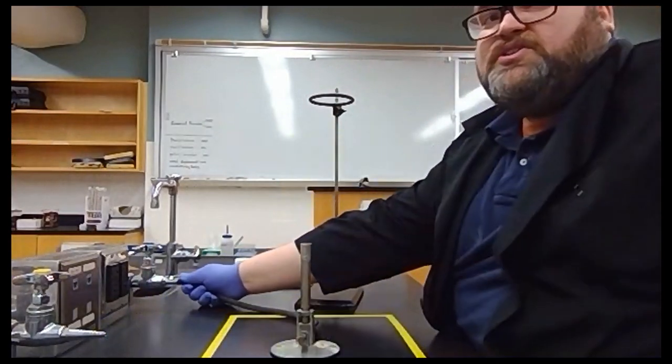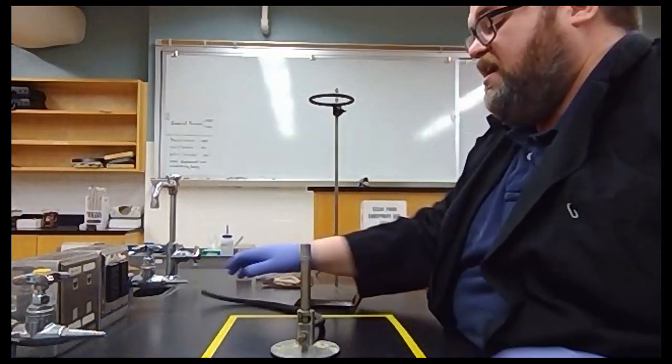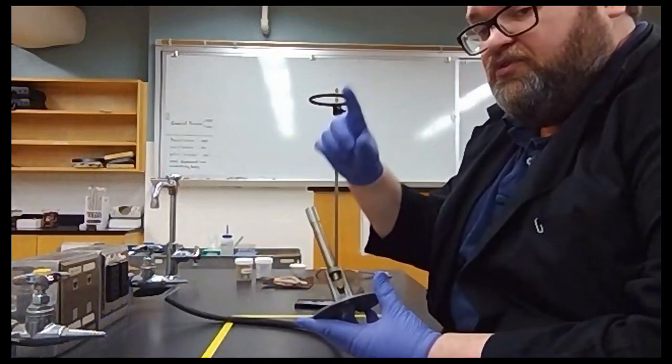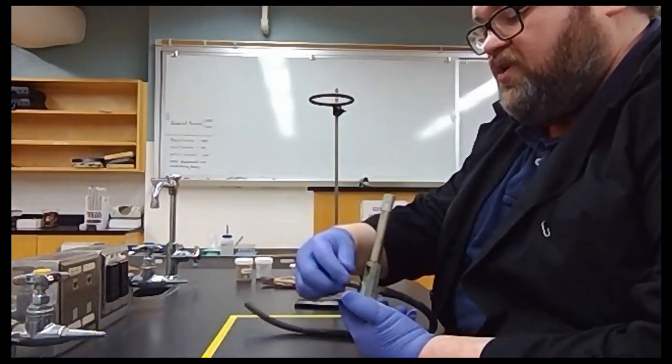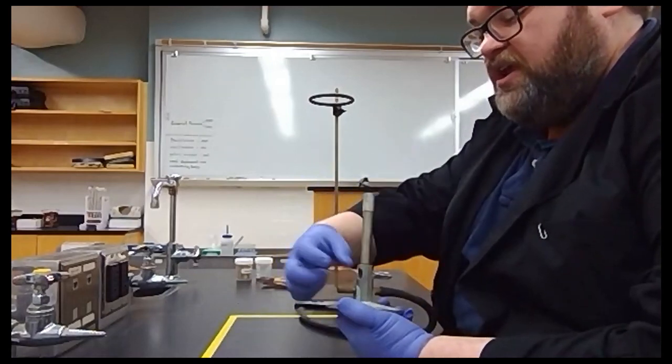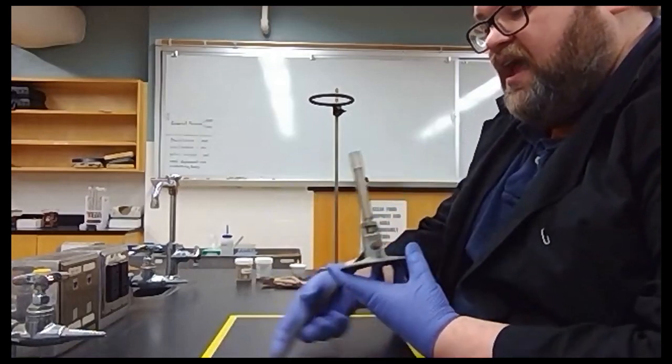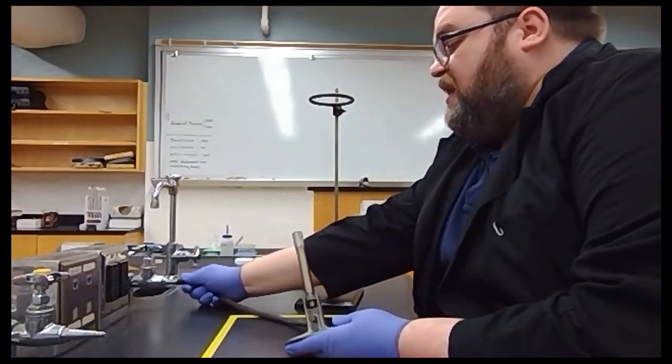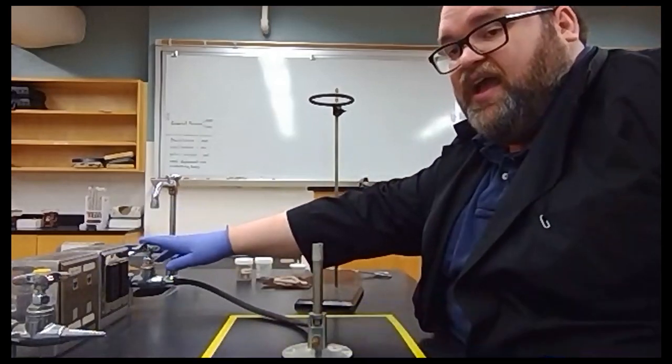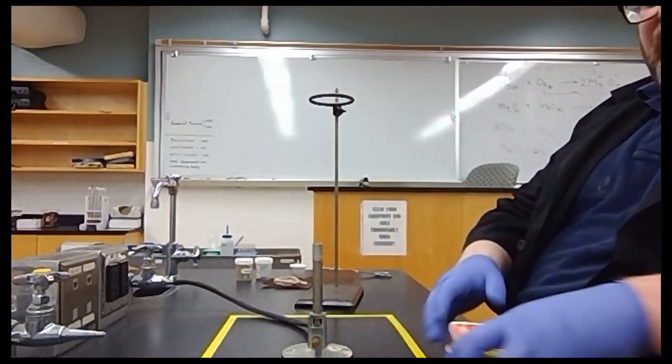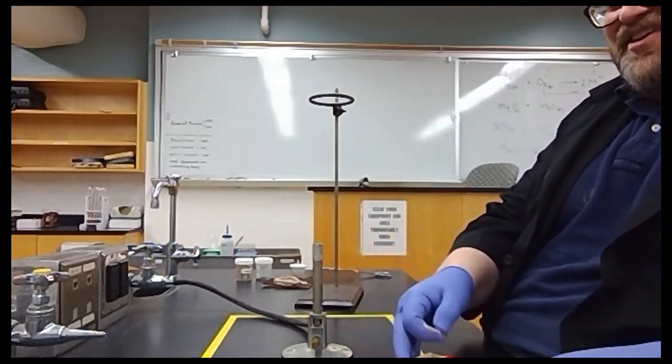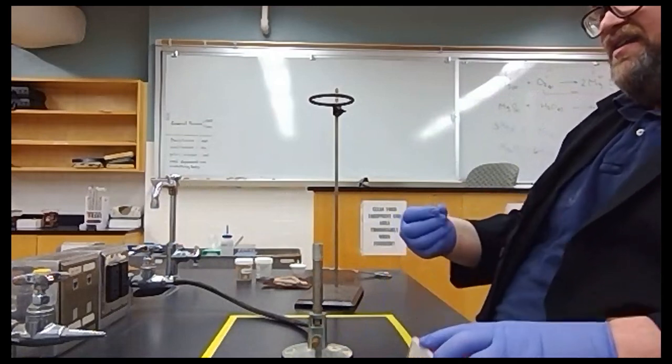Next we're going to take our Bunsen burner, and remember for safety we always completely close our Bunsen burner whenever we first get it. Then we turn it two big turns on both the bell and the gas inlet. Then we attach it to the gas main. At that point we're ready to start trying to light the fire.